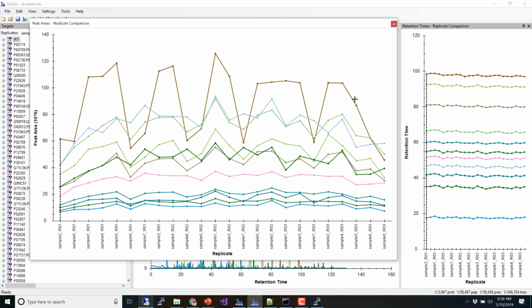That's the first one. So maybe the column wasn't conditioned well, or maybe this is really an artifact of how the instrument was being run at that time. It's the lowest thing. It's the first one. We can kind of see this curvature going up. So it might be that they should have done more work to condition the column, and the column's not really even fully conditioned until they get out to here, or something, right? So yeah, just by looking at the IRTs, we can learn interesting things.